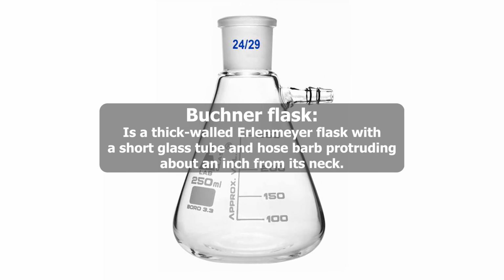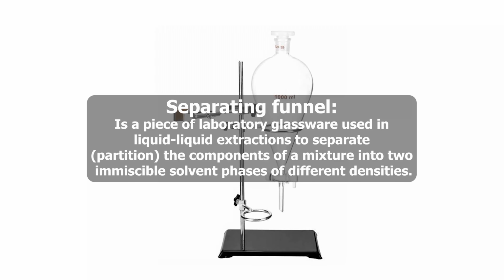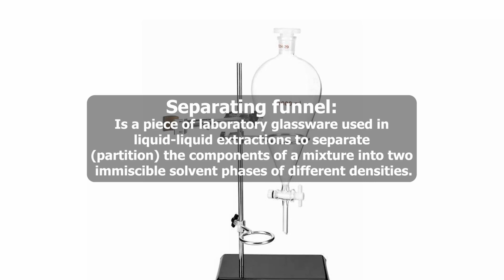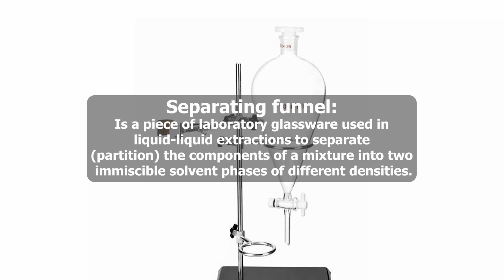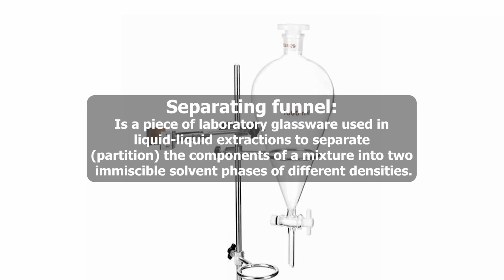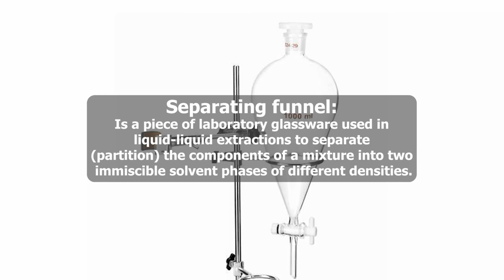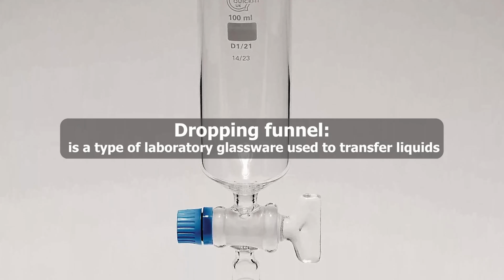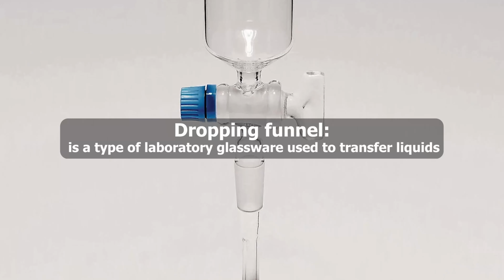inch from its neck. Separating funnel is a piece of laboratory glassware used in liquid-liquid extractions to separate the components of a mixture into two immiscible solvent phases of different densities. Dropping funnel is a type of laboratory glassware used to transfer liquids.